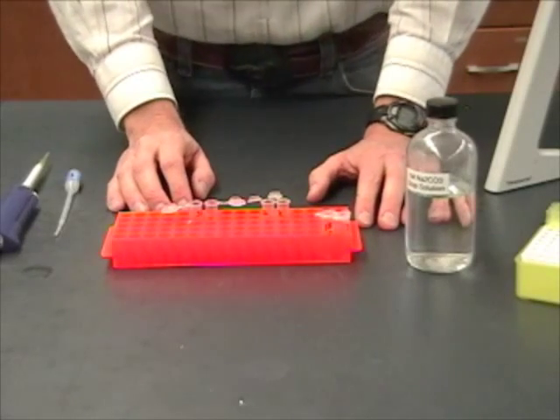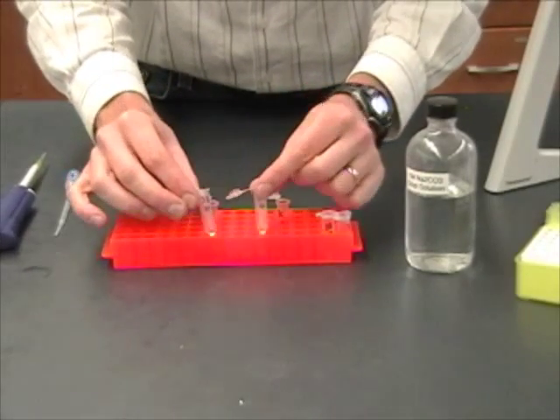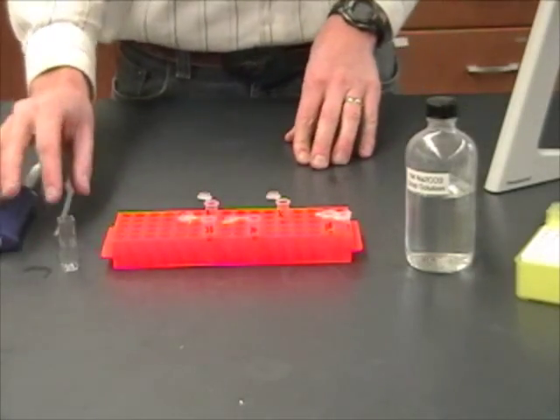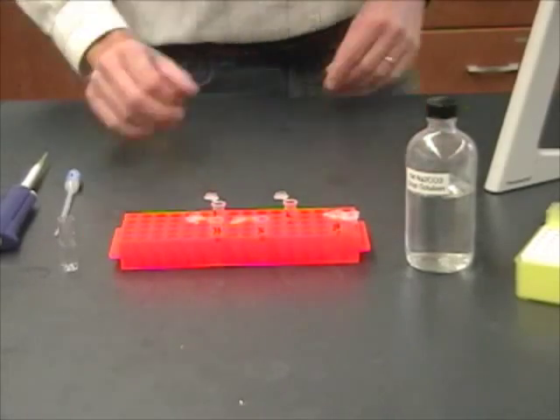Looking at the clock on the wall, I realize it's about time for our next time point — it's been about 20 minutes. So I'm going to get my tubes B and C with the 20 written on them and get those ready. I've also got my cuvette that's been emptied out and cleaned for testing the concentration of the bacteria. Now I go back to the incubator to get my sample.